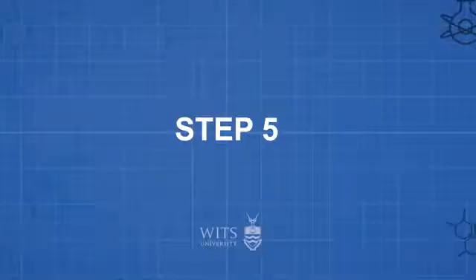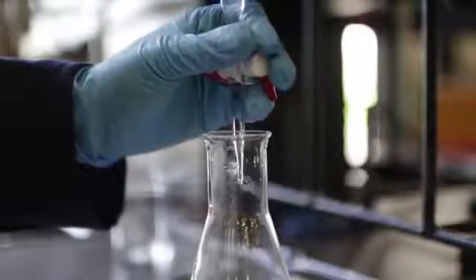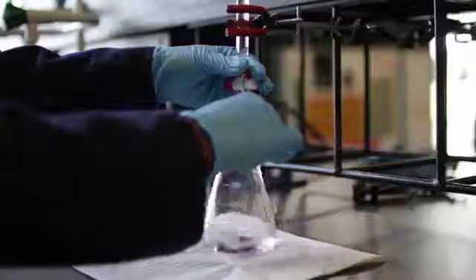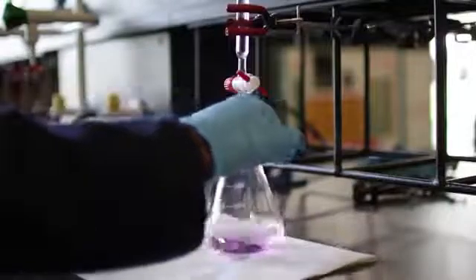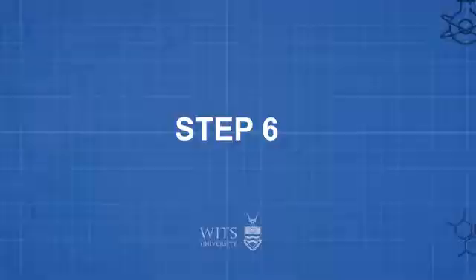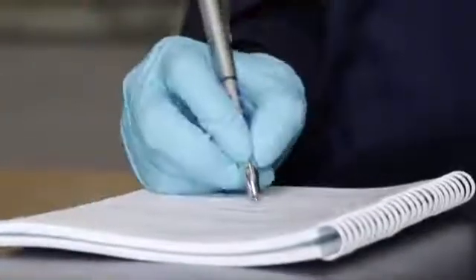This solution contains a chemical that will react with the analyte chemical sample in the conical flask. Step 5. The solution from the burette is run into the conical flask. The solution is added 1 drop at a time and swirled to mix the solutions as the endpoint is approached. Eventually, a color change shows the correct amount that has been added to react completely with the analyte chemical in the sample. Step 6. The volume of solution added from the burette is noted. The titration results can then be used to calculate concentration.